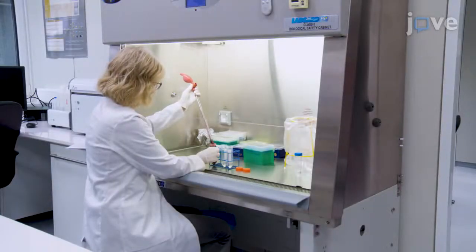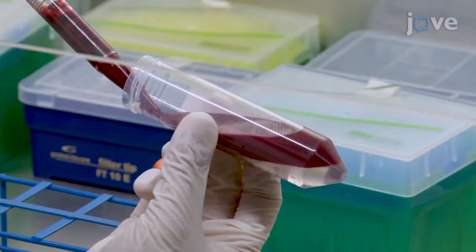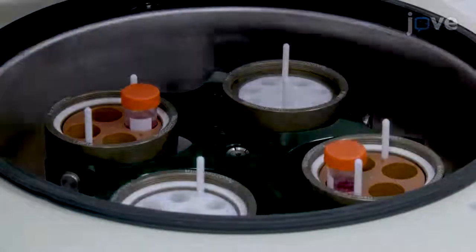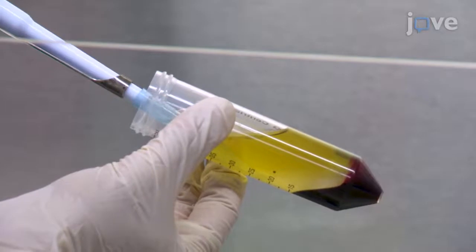To isolate PBMNCs, add 25 milliliters of 1-to-1 blood diluted with PBS to 10 milliliters of density gradient media and centrifuge the mixture at 300 times G for 30 minutes. Isolate the interphase layer between the plasma and the density gradient media by pipetting.